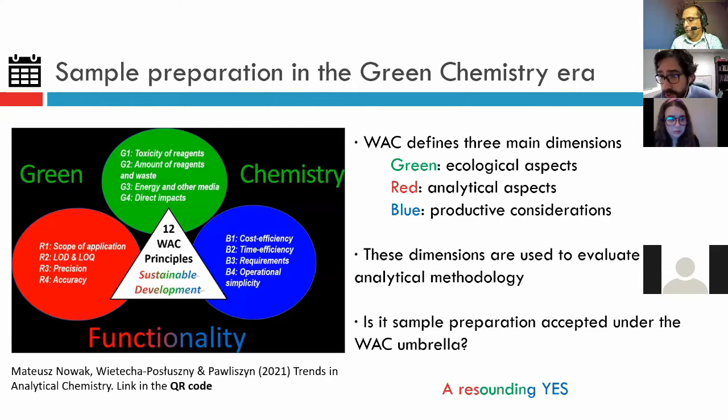So, for example, the use of ionic liquids can be considered in this context because in some cases, especially when we are substituting conventional organic solvents by ionic liquids, we are doing things greener. Then we can discuss the toxicity and so on. I'm not an expert on that, but it is something that we can discuss. So ionic liquids can be considered under this green analytical chemistry realm.